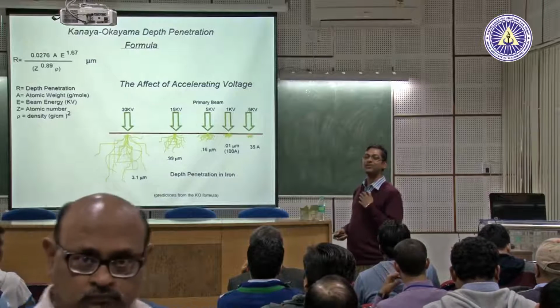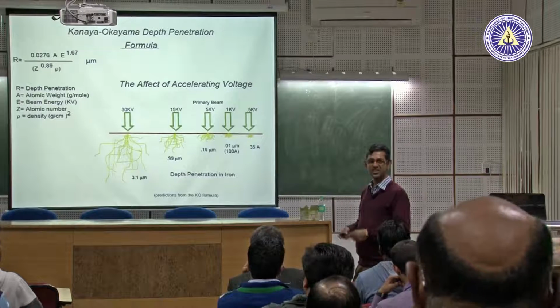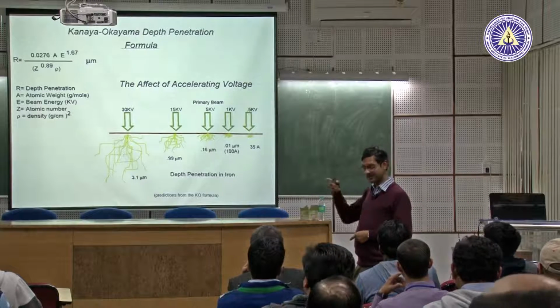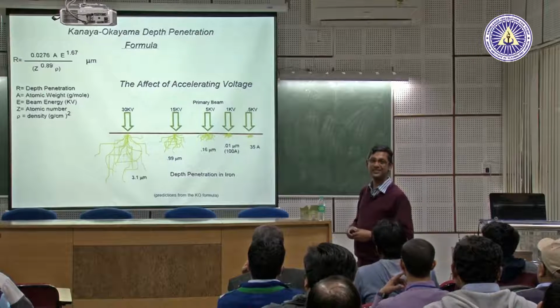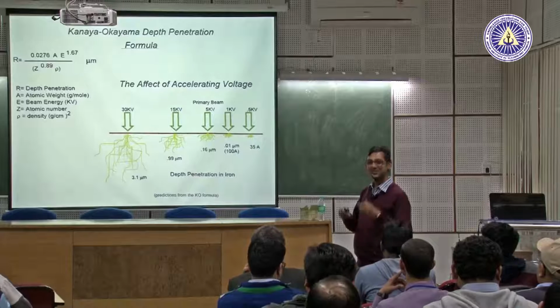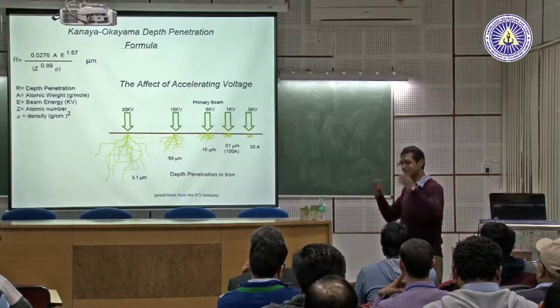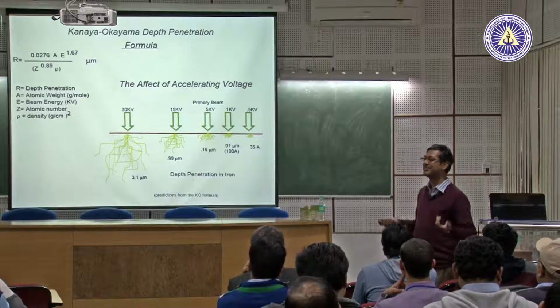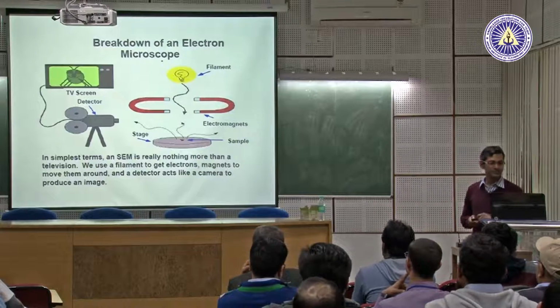That's why one of my teachers used to tell me that doing electron microscopy means sitting in a cold, dark room, using your hot brain to think. That is the biggest challenge our students always face. Sitting in front of a microscope, they stop their brain from working. Then they collect the data and come back, and something is wrong. So these are the things you should not forget.